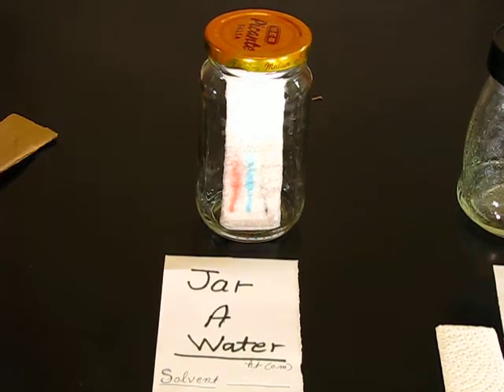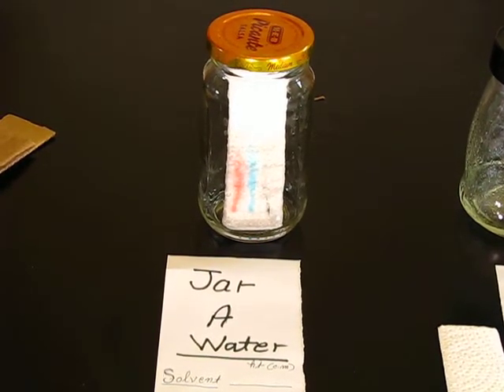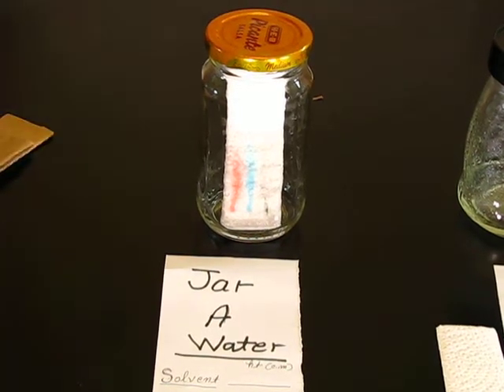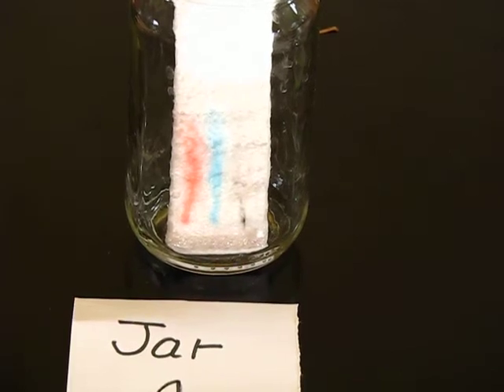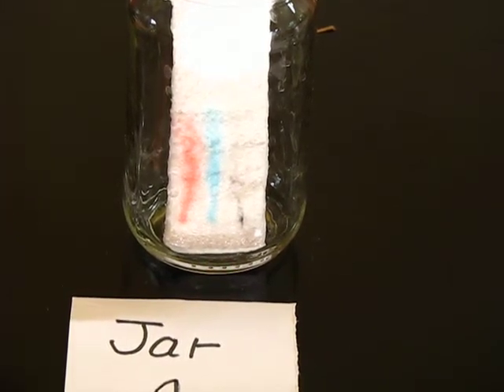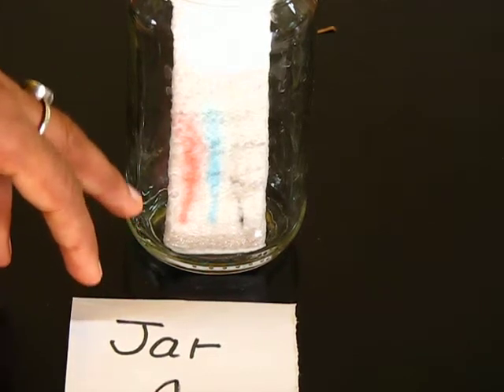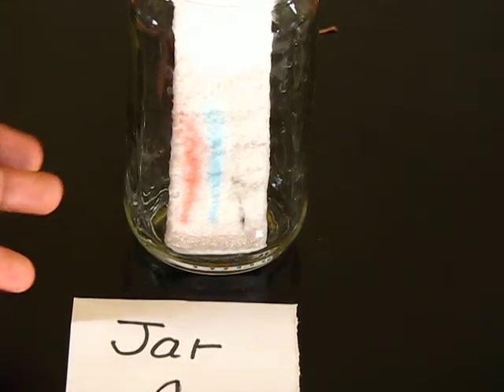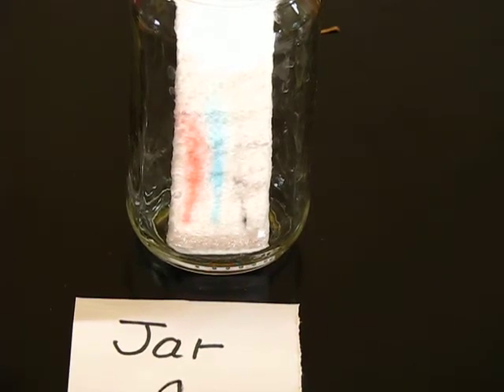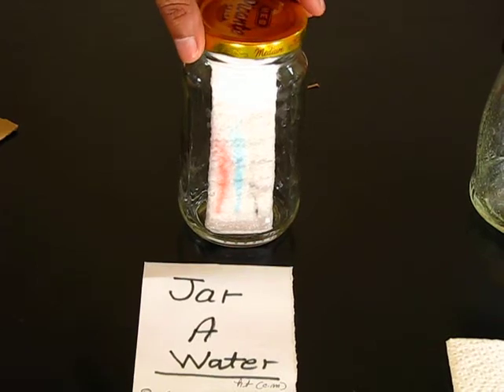The TLC paper is the stationary phase, and the liquid — water in the jar — is the mobile phase. This is essentially a polar TLC we have made. Water is still running. In an organic chemistry lab, TLC spots move cleanly with no streak; here there is some streaking because the compound is absorbing onto the paper very fast.